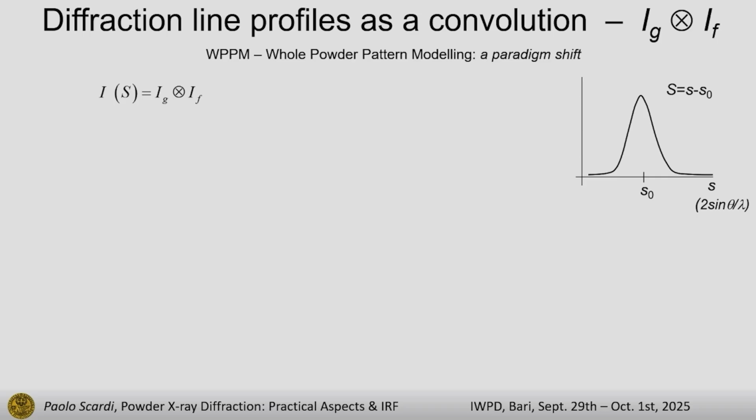So what has been the idea of the method I have proposed? Well, the instrument is a convolution of all the different components in the instrument. Let's assume it is the same for the microstructure, which is not exactly true, because these things are not independent. The size and the strain are actually all combined in the material, but this is a decent first order approximation.